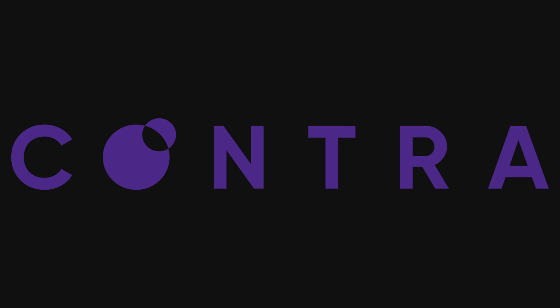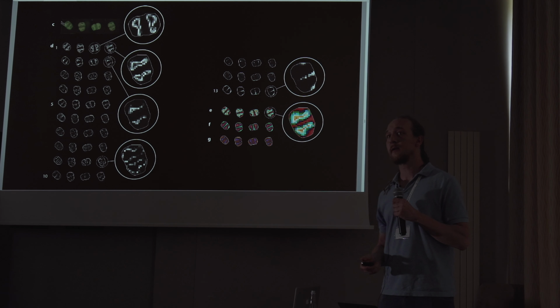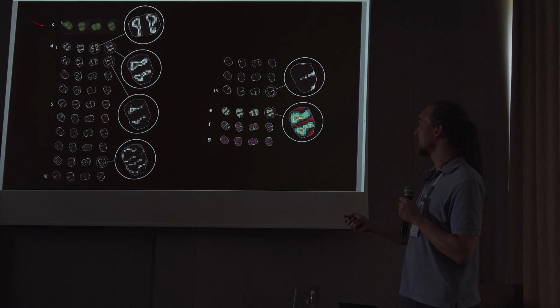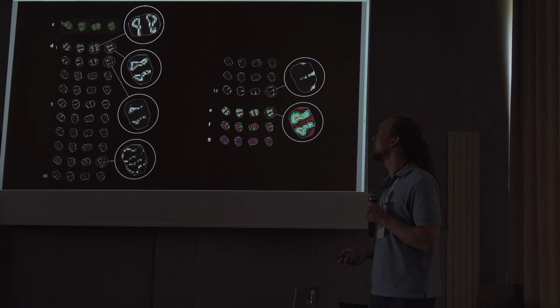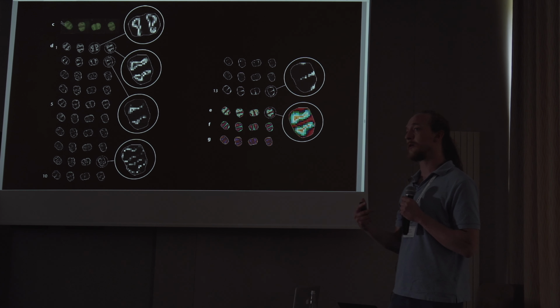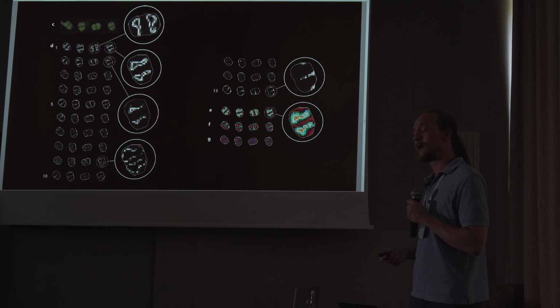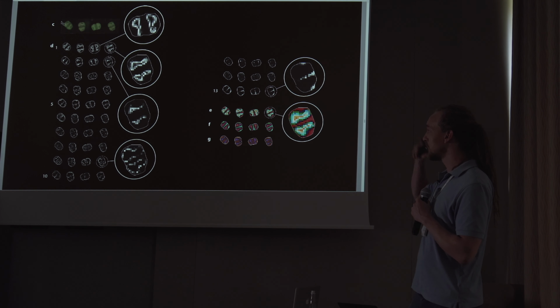So here's the olfactory bulb. In this analysis, I actually used 16 samples, the same 16 that I had earlier on a slide. And there's only 4 samples shown. They're in the columns here. The bright field image, or its inverted version, is up there. And the different rows then are the spatial activity maps, as we call them, for the different factors, of which here also only 13 are shown. There's another 7. We used 20 factors in this analysis.